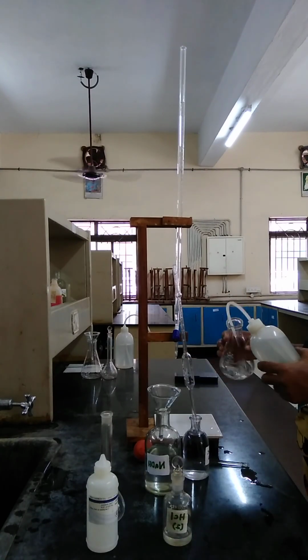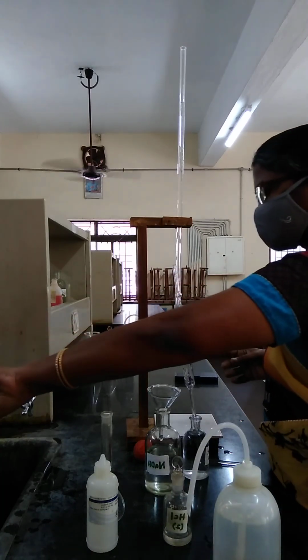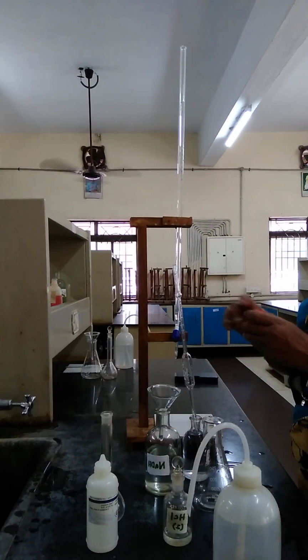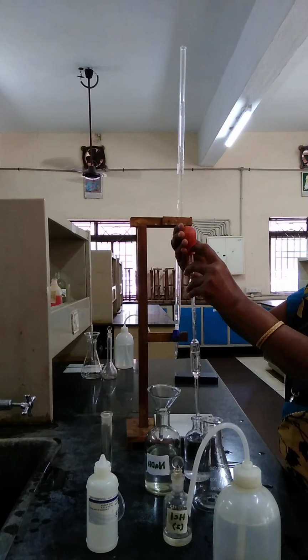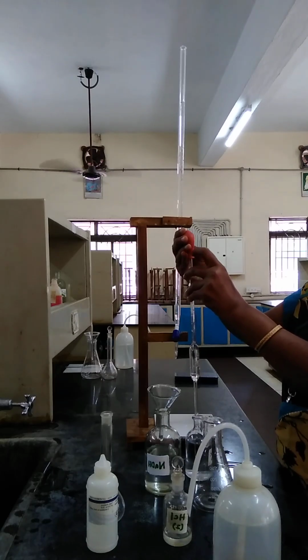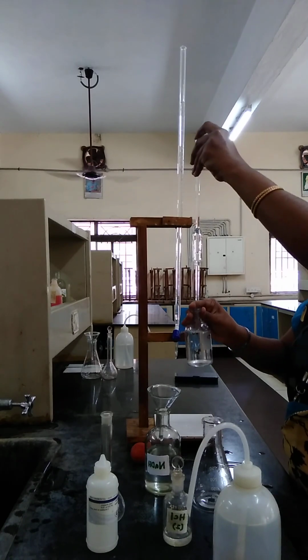So already we washed all the glasses. Just for the demo, once again we are washing all the things as per the procedure. So the conical flask is ready. We can use the mouth pipette also. It's not that much tedious, just normal concentration. So you can use the rubber bulb to suck the solution into the pipette. This we can take up to the mark.